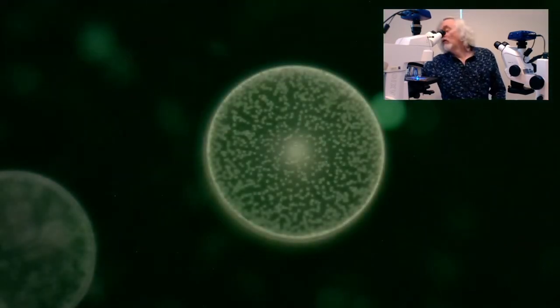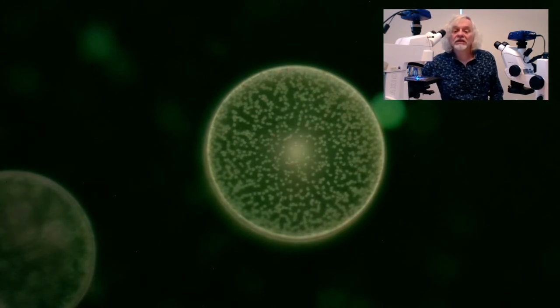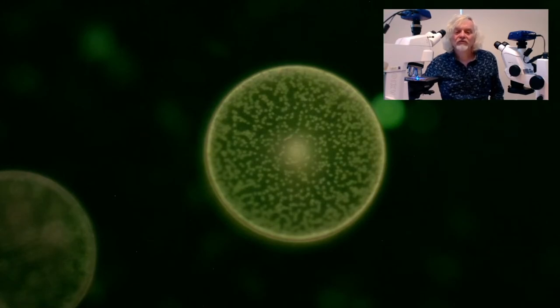there they are, all the tiny chloroplasts will show up in beautiful green. There you go, which is rather lovely.